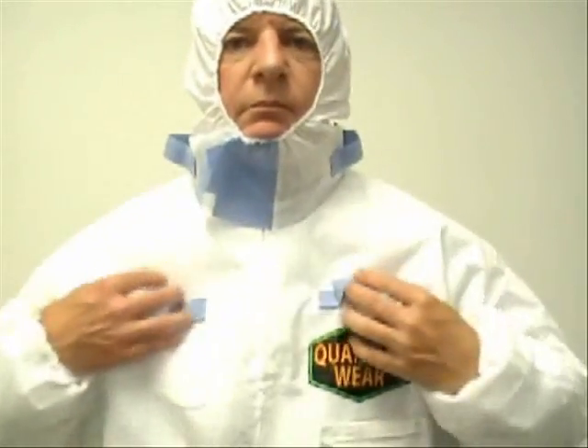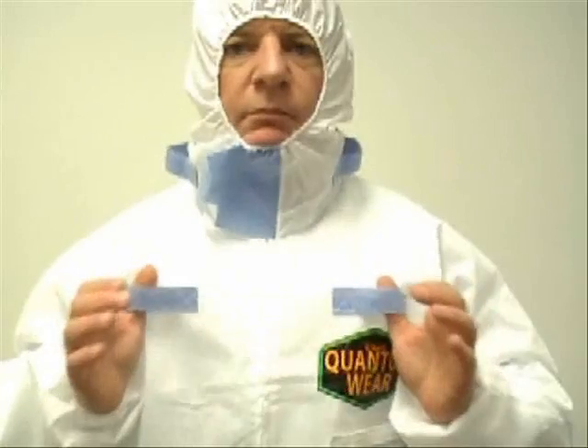The Q-Guard Quantum Wear Suit features two sets of doffing straps which allow the worker to remove the garment without touching the zipper and risking exposure from contaminated particles on the worker's gloves. One set is located on the hood of the garment and the second set is located on the chest of the garment. Both the adjustable flap and doffing straps are made of a blue material to help make it easier to find these features.